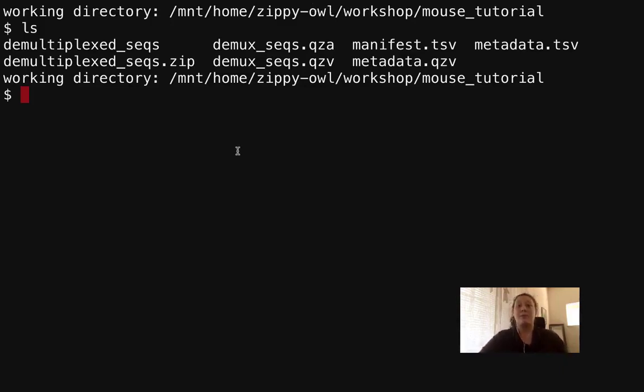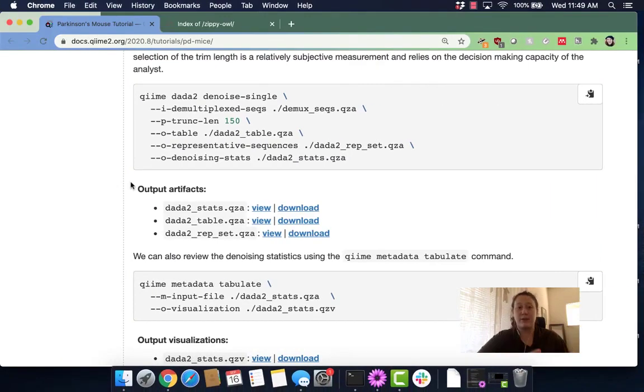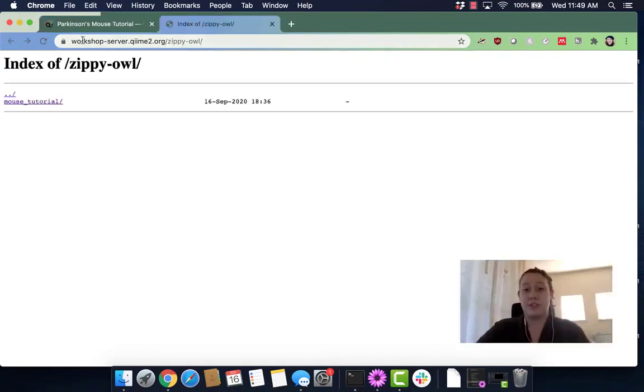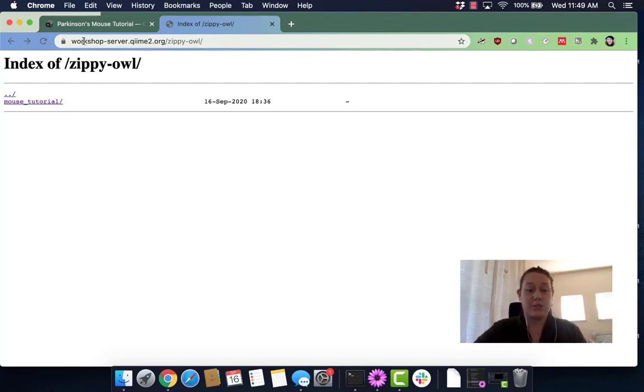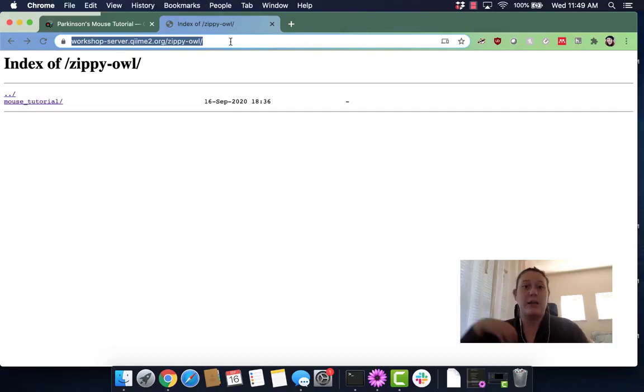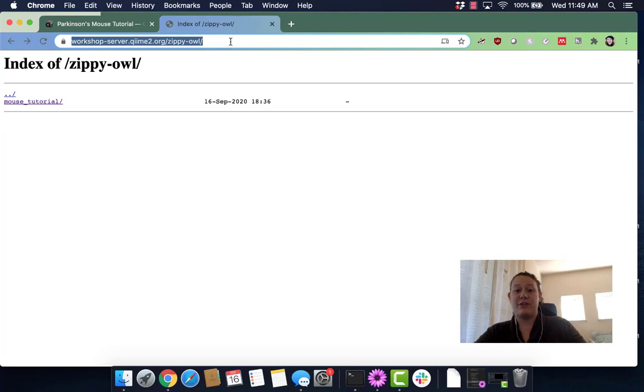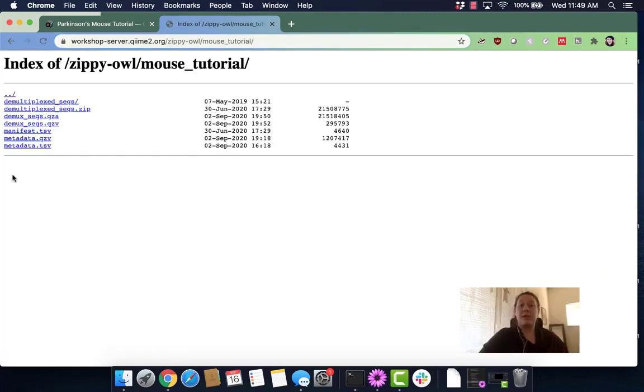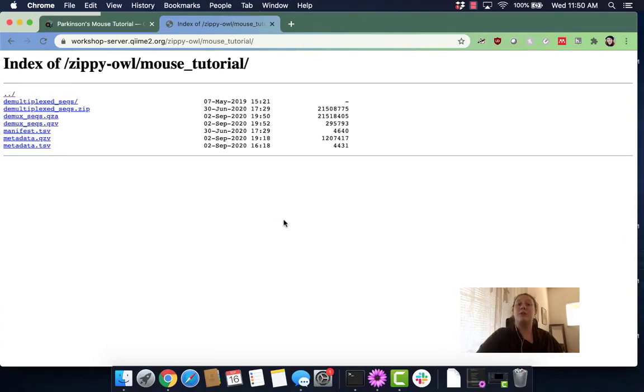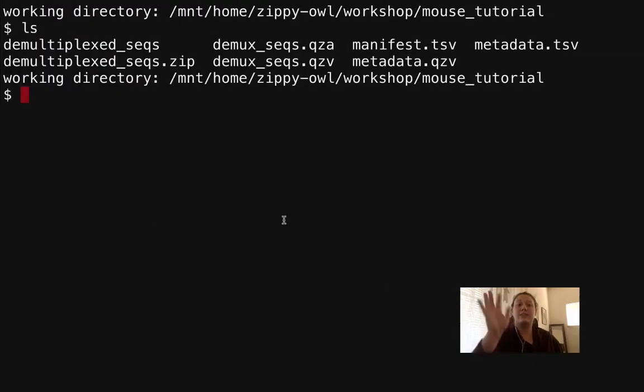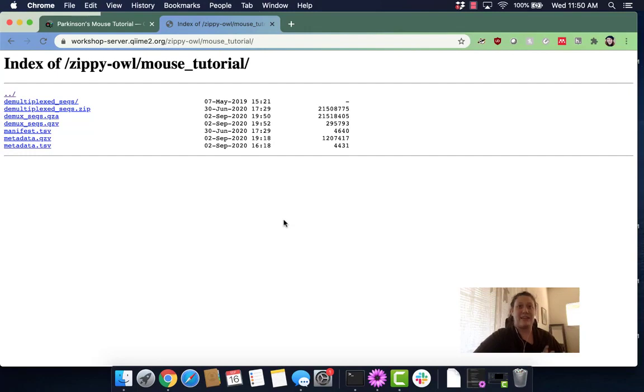First we need to look at this visualization in order to see what the quality of our sequences is and where we should truncate. We need to go to the location where we can get the visualization. We're going to go to workshop-server.qiime2.org, zippy-owl, which is my username—make sure to enter your username. I go to my mouse tutorial directory and here you can see all of the files that we could see over here, just organized differently.